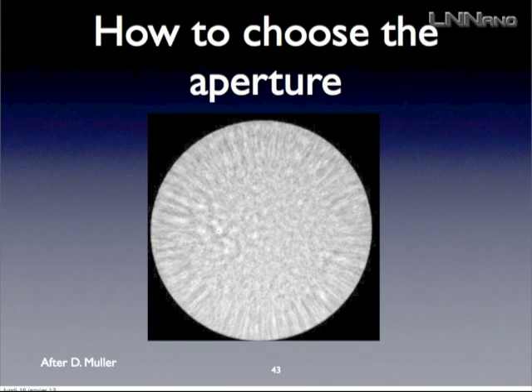But if you have a non-aberration-corrected machine, what can you do? You can correct the astigmatism. So you can do it on the Ronchigram. Yes, okay, I didn't put it on the slide. But you can correct it directly on your Ronchigram, and assume you did it.